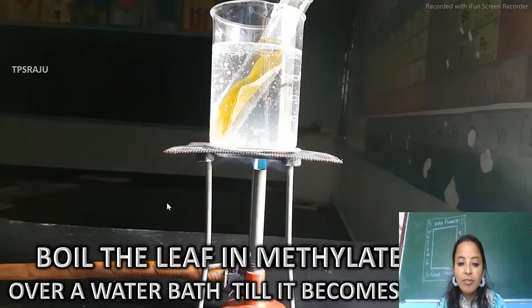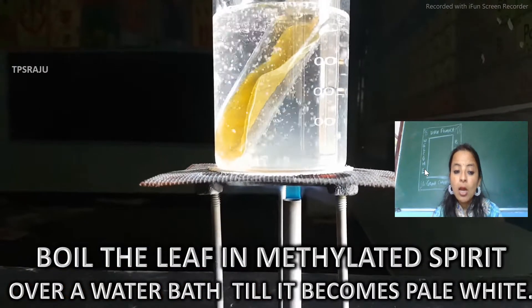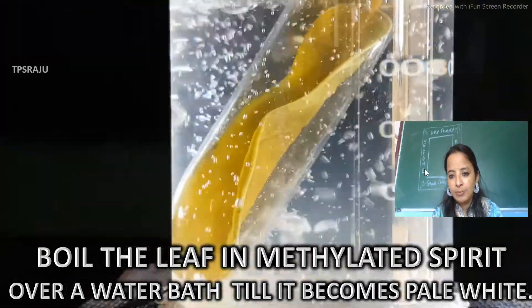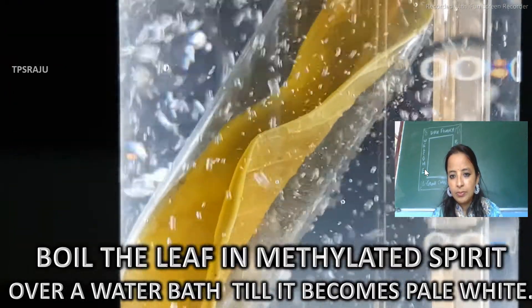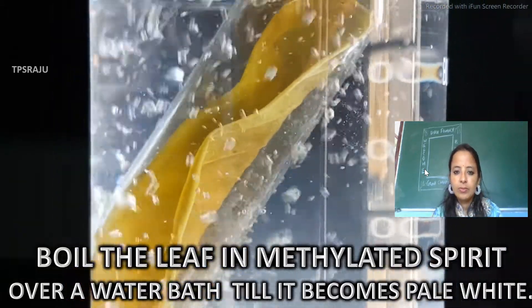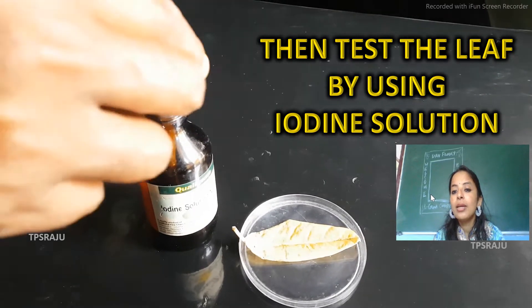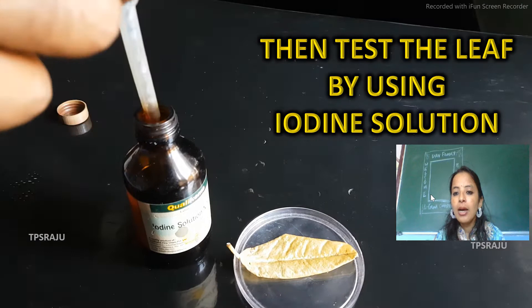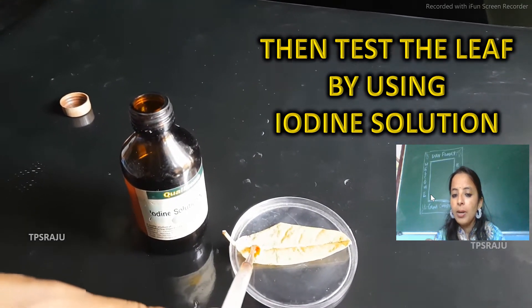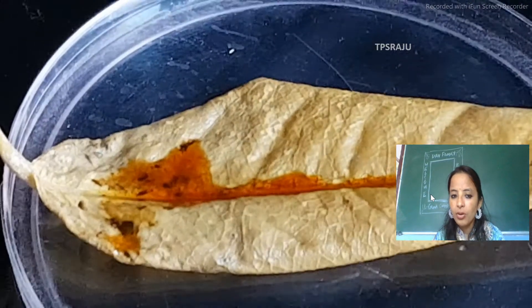Finally, we will boil the leaf in methylated spirit over a water bath until it becomes pale white. Then we are supposed to do its iodine test. We will take iodine solution and drop it on the leaf which we have boiled in the water bath.